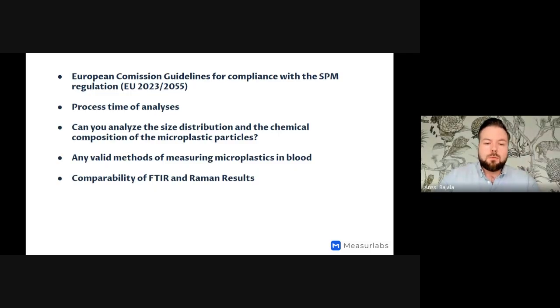And also there is the difference in the detector type, as FTIR usually nowadays uses FPA detectors and Raman relies on point-by-point measurement. So they are comparable and should give quite similar results, but if there is a small particle or fiber-like particle that has a weak vibration in the method, then it might not be well visible in the one that is weak in it, if this makes any sense.